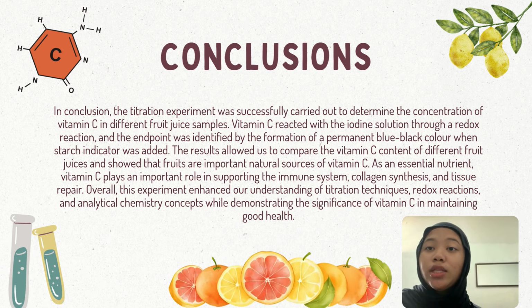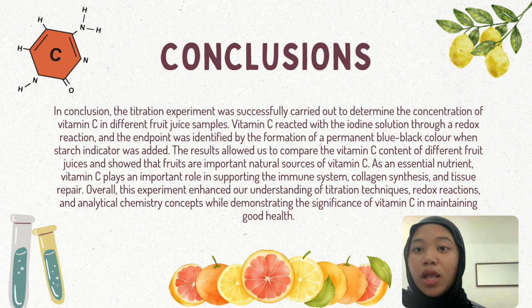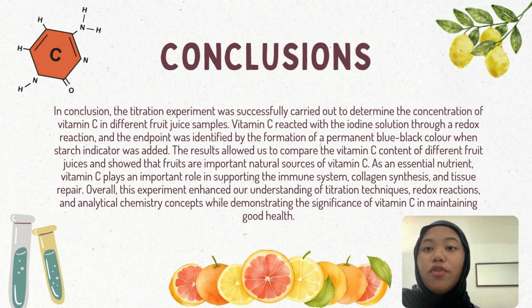In conclusion, the titration experiment was successfully carried out to determine the concentration of vitamin C in different fruit juices. Vitamin C reacts with the iodine solution through a redox reaction, and the endpoint was identified by the formation of a permanent blue-black color when starch indicator was added. The result allows us to compare the vitamin C content of different fruit juices and shows that fruits are important natural sources of vitamin C.